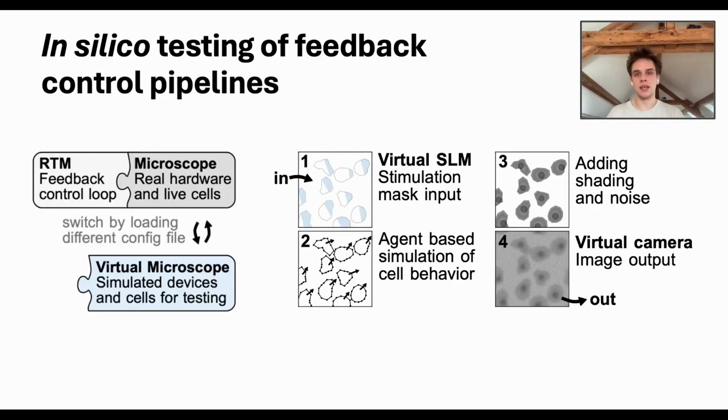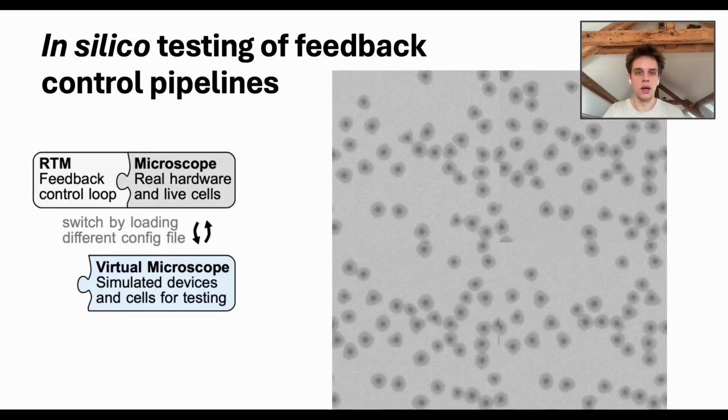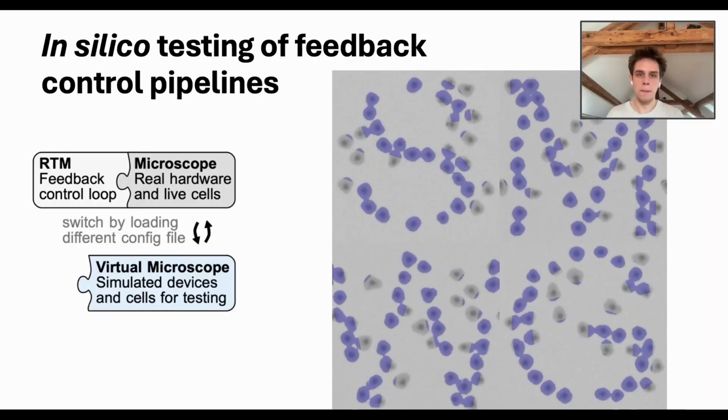So instead of classical simulation devices that read out pre-acquired data and display those, these are actually simulations that respond to input also, so you can really test if the feedback component of the pipeline also works. Here you can see a simulation of cells that behave in a similar way to the cells I've shown you that migrate towards the stimulation regime.